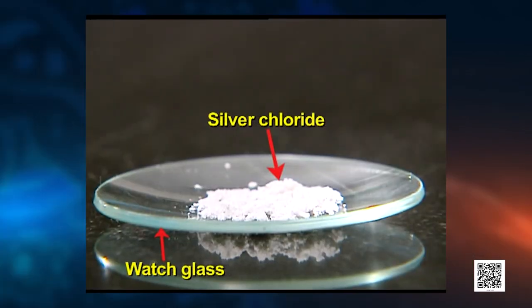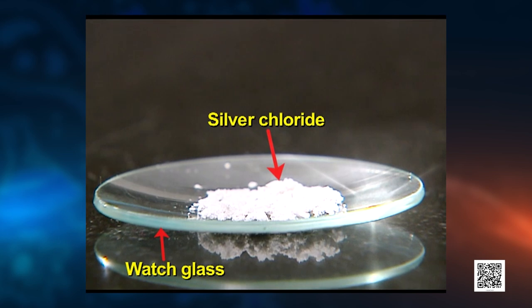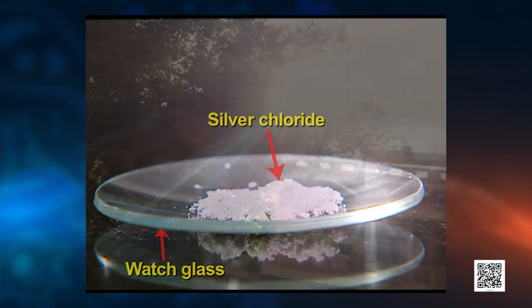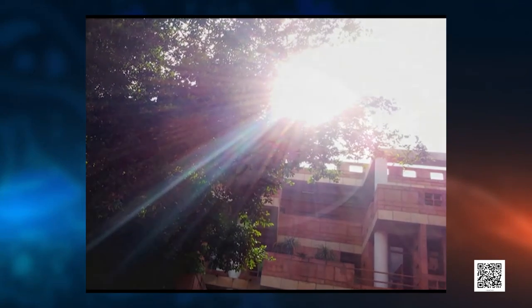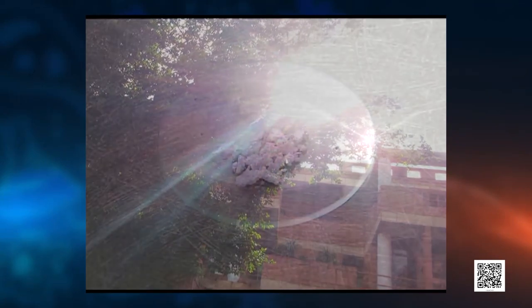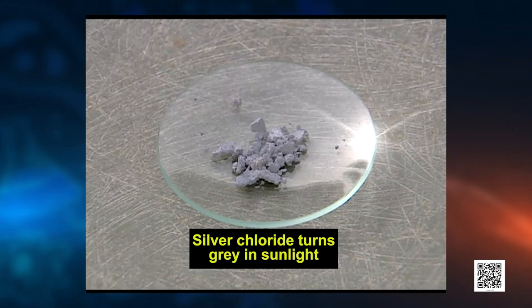Let's learn through this video. We have taken 2 g of silver chloride in a watch glass — its colour was whitish. It is placed in sunlight for some time. After some time, silver chloride turns gray in sunlight to form silver metal.